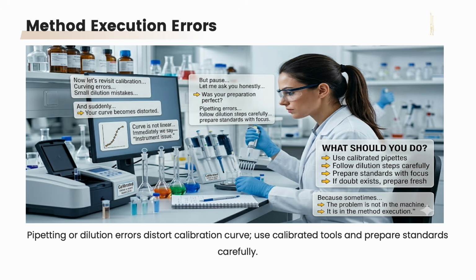Now let's revisit the calibration. Curve is not linear. Immediately we say instrument issue. But pause. Let me ask you honestly, was your preparation perfect? Pipetting errors, small dilution mistakes, they accumulate and suddenly your curve becomes distorted. Now the instrument is correct, but your preparation is not.